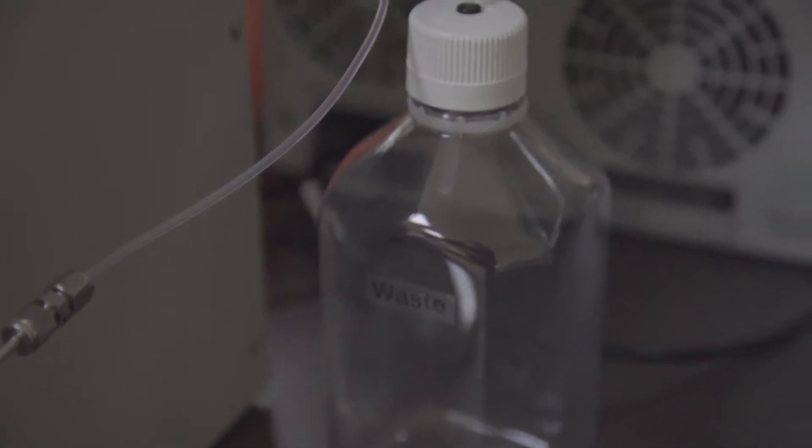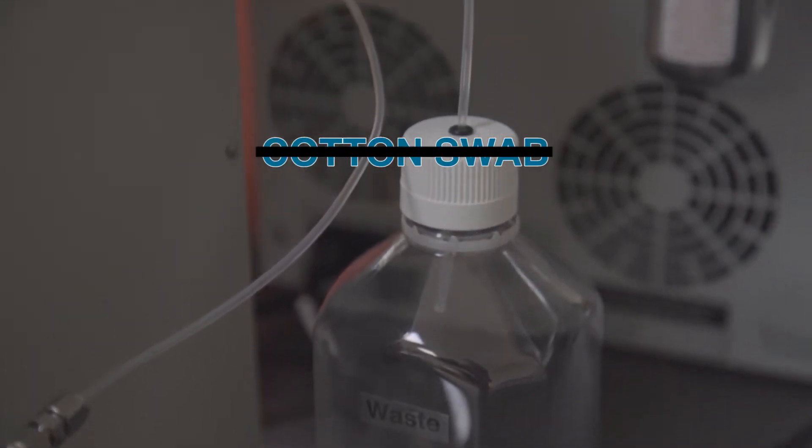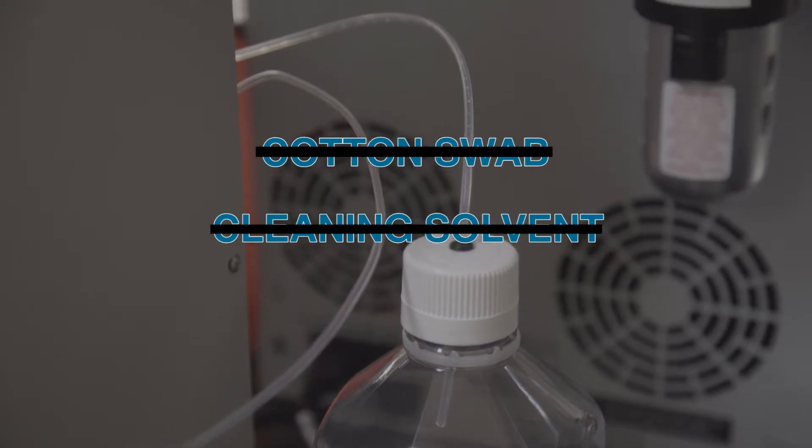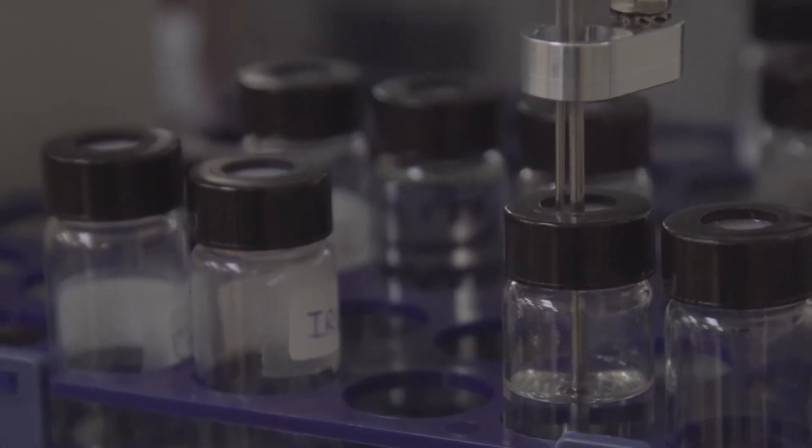The JFA 70XI has an automatic self-cleaning cycle that rinses and disposes of the remaining sample. No cotton swab is needed. No cleaning solvent. It saves you time and ensures perfect cleaning.